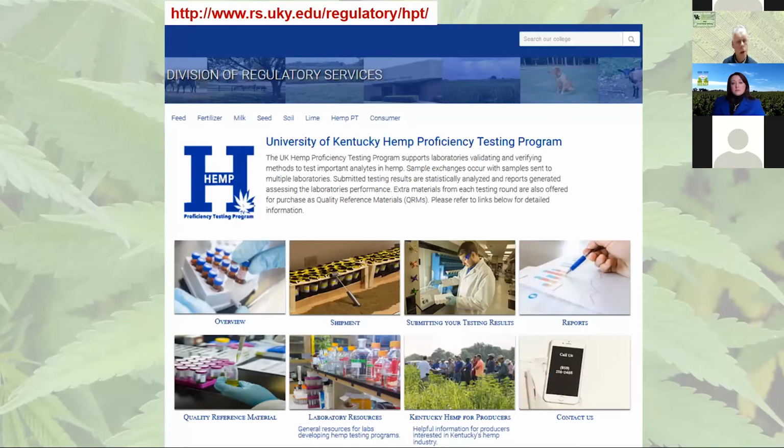This is the home webpage for our hemp PT program. The program was started in the fall of 2018. Every year in the program, 4 samples are sent out, in 2 shipments: two samples in September and 2 in November.